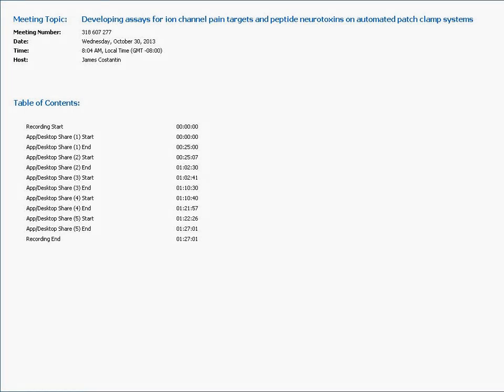So they found that this compound does not block the pore, but it binds to the voltage sensors of the ion channels that the previous speakers were talking about, and it inhibits the activation of the channel. With their intense analysis of this compound, they came up with this simple model. They have a more complicated model, but in this simple model you have the voltage sensor in the resting state, and it goes to the activated state, then it opens. The idea is that the BRMT compound inhibits the transition from the resting to the activated state of the voltage sensors.